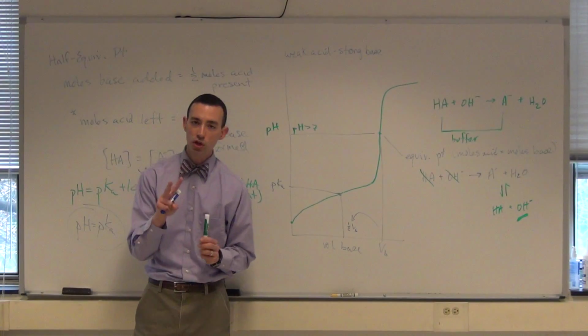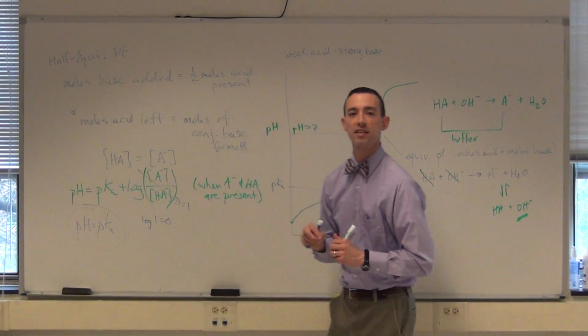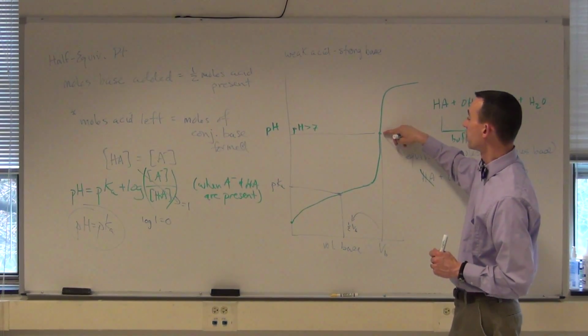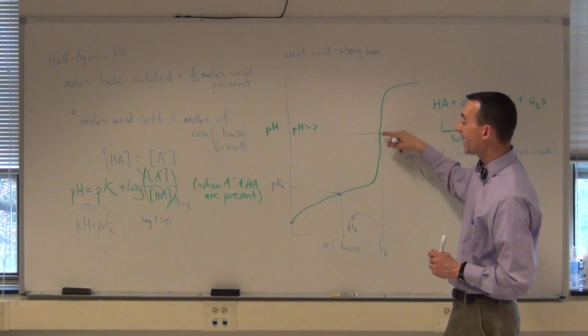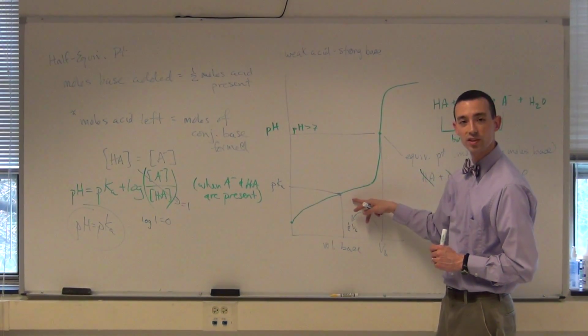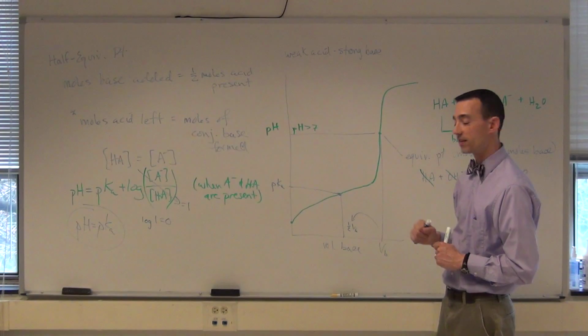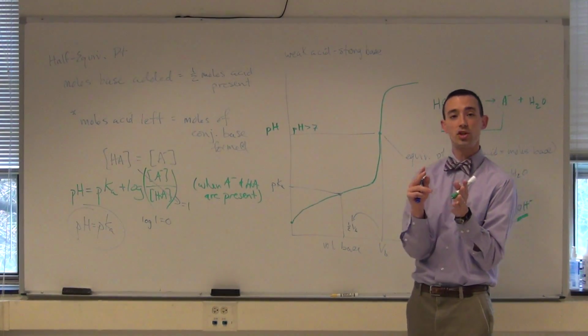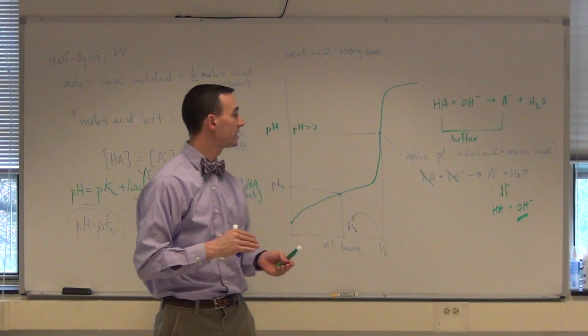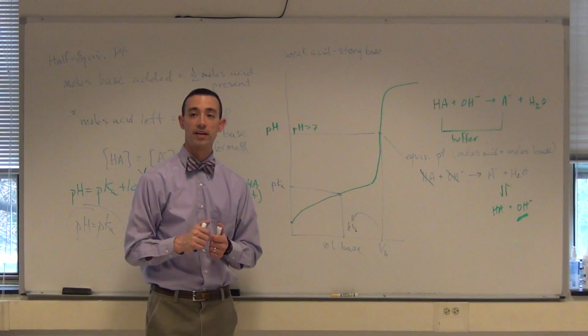So you'll have two properties of your acid from this experiment. The molar mass, which you will derive from the equivalence point, and the pKa, which you will get from the half equivalence point on your graph. All right? And those two should be enough when you're given a list of potential acids to identify which acid you were working with.